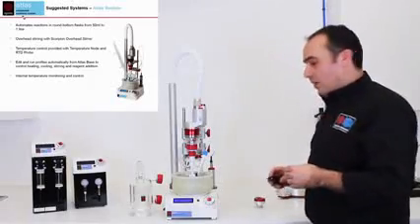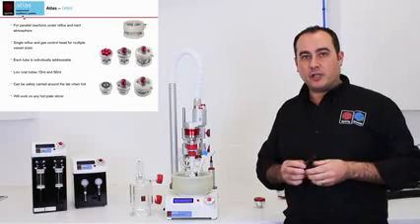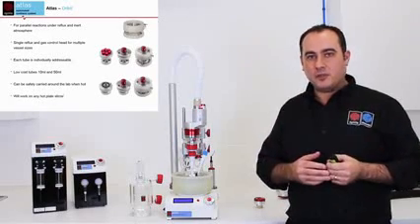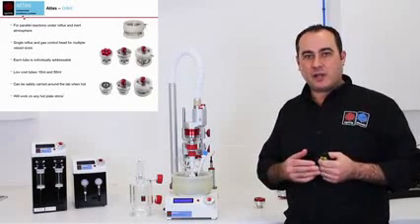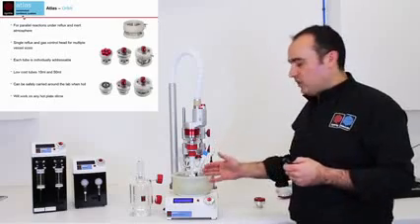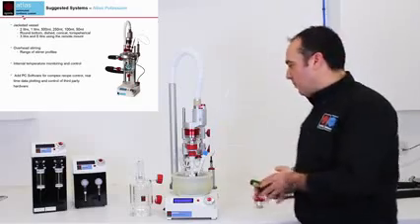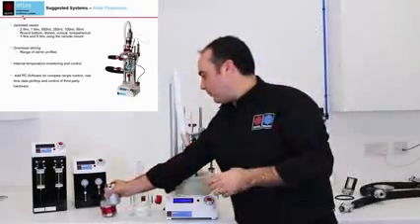So instead of having round bottom flasks and building up, I'm now going to look at some of the other smaller scale devices that we have. So we have the orbit system for parallel chemistry, so parallel reflux. That can be with either 6 parallel systems or 12 parallel. And we have also many smaller parallel vials that you can use in hot or in cold. So we're now going to build up the system to our jacketed reactor platform.